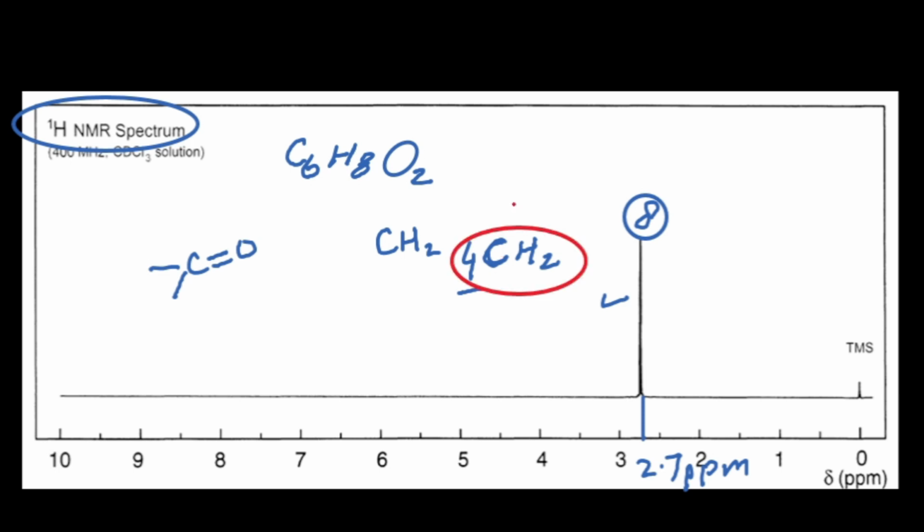Okay, and now if you see here, 6 carbons were present, and 4 carbons we have already used to make the CH2 groups, so it means now 2 carbons are left. The other type of carbon that was present in your structure was the carbonyl group, so it means in your structure 2 carbonyl groups are present. Now we will arrange this data such that only the protons that have the same chemical environment should be present in your compound.